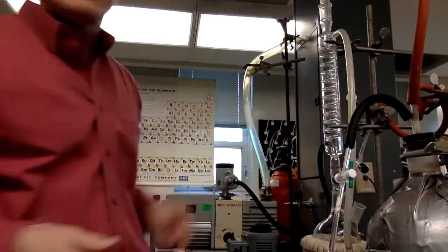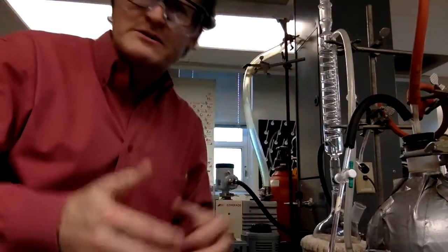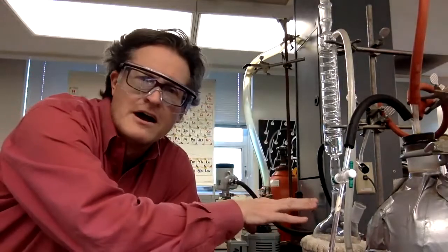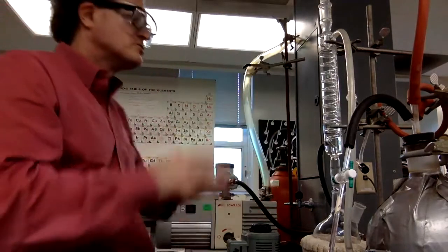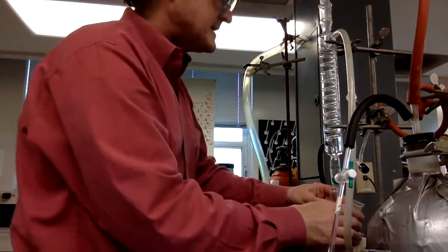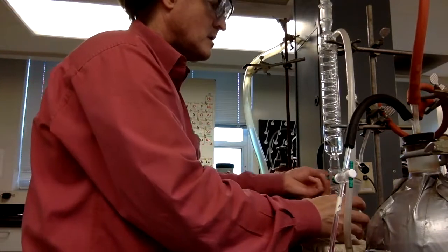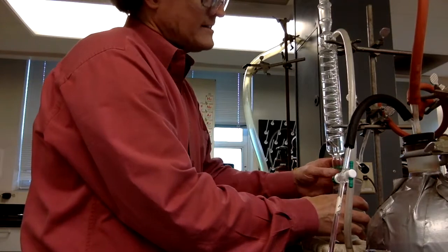Now, why do we need the vacuum? Because what we want to do is just measure the pressure. We're going to get rid of the atmosphere above our sample. We want it to be just the ethanol or heptane in there, so that we can measure the pressure and control the pressure in that region. So we attach our round bottom flask.